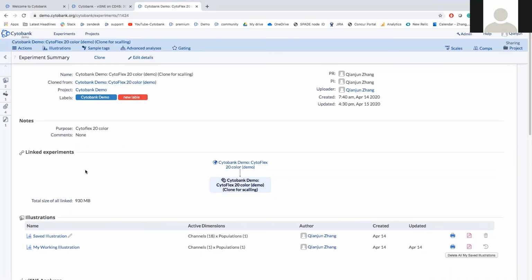There are a few other questions. Let me see. Going through the question link. So Steph, you probably want to take this one. It says ACS files are generated in FlowJo.